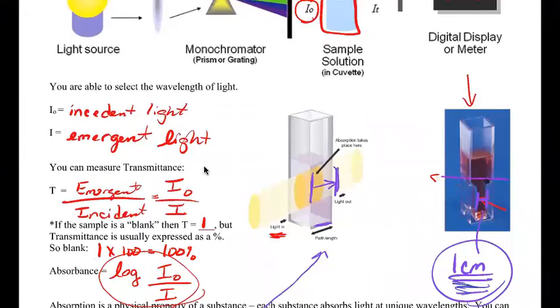So you want to make sure that you're putting enough that you're filling this entire bottom portion of the cuvette, because that's actually the part where the light is going to go through. So you see where it necks down. You just want to leave a little bit on top of that part where it necks down, and you'll have plenty of sample. So that's about 1.5 milliliters, but you don't have to measure and be precise. This is one of those, just pour, make sure you have enough.